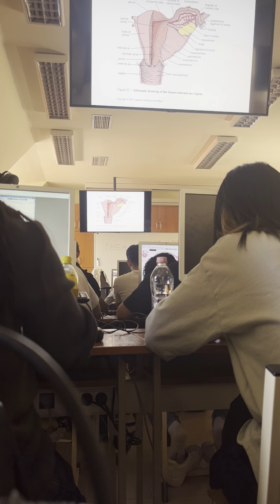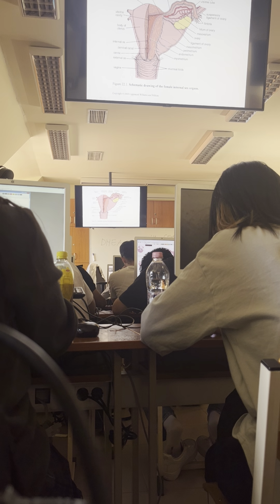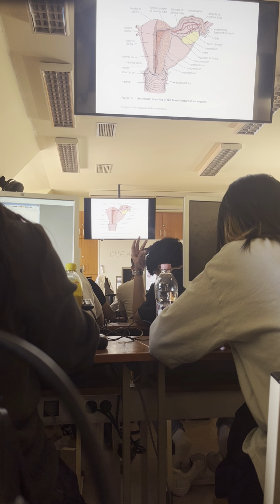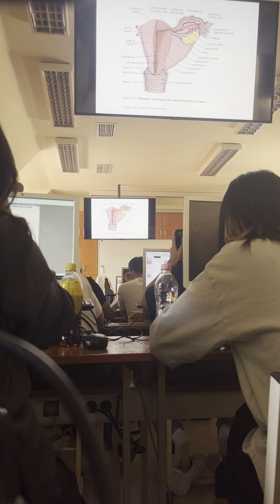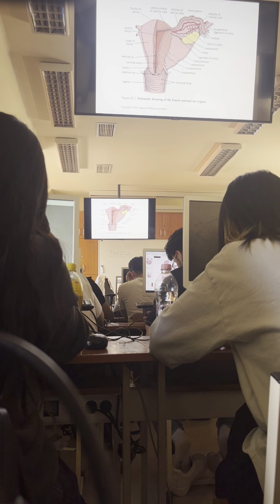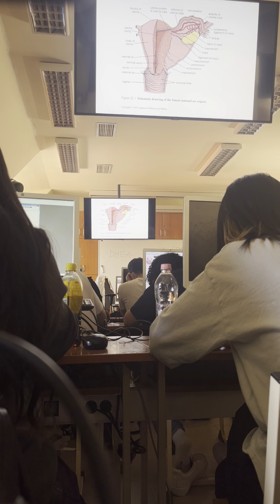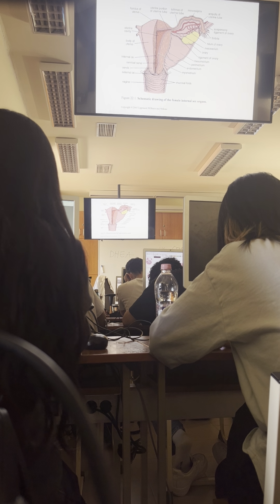So this drawing is showing one of the uterine tubes as connected to the uterus, and the other end is freely opening into the abdominal cavity, and this is the so-called fimbriated end. These kinds of fringe-like protrusions are called fimbriae, which can move and help in sweeping the ovulated egg cell into the cavity of the uterine tube.